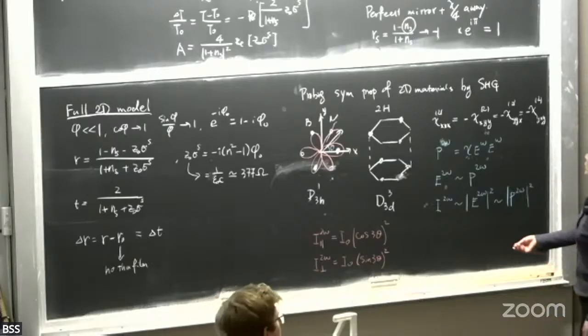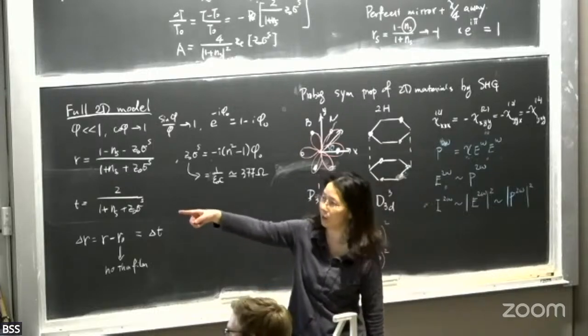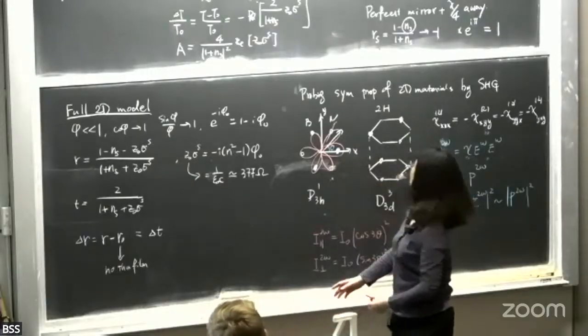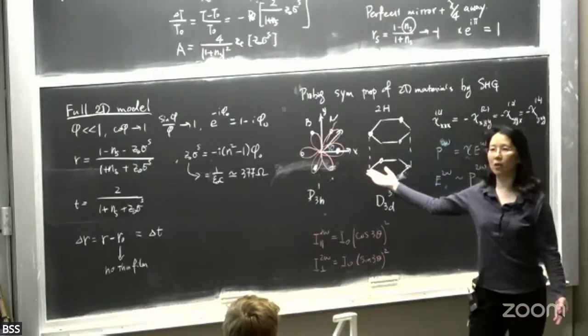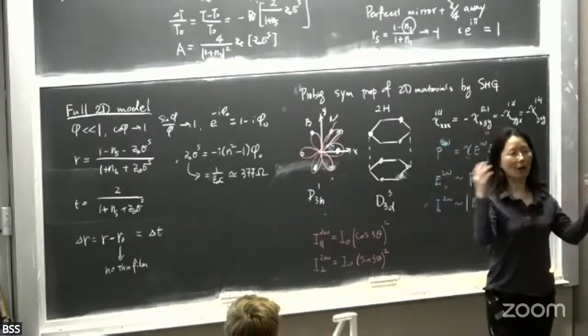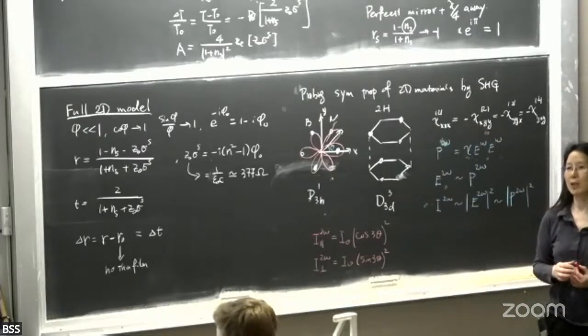Yeah. So the typical measurement is just as what I drew over there, and then you can rotate your sample, and this is what you can get. Okay. So now by looking at the direction for maximum second harmonic, you know this is armchair, this is zigzag. So you know the crystallographic orientation.